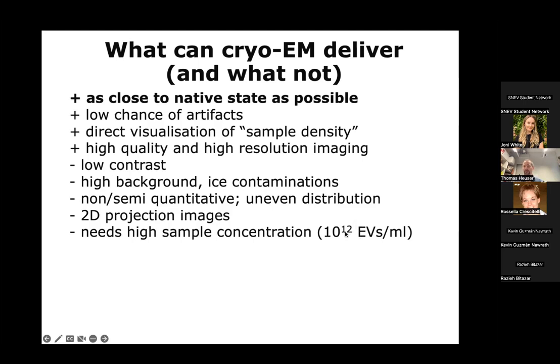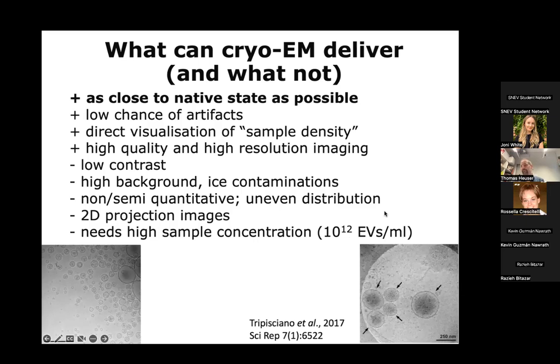Yeah, we're talking about something like this here, which will be very difficult to get. And in some cases, this cryo writer or this cryo sprayer might help you if you can only produce very low amounts of your sample. Yeah, good. So this is how an idealized liposome sample would look like. A real life sample typically looks like this here.